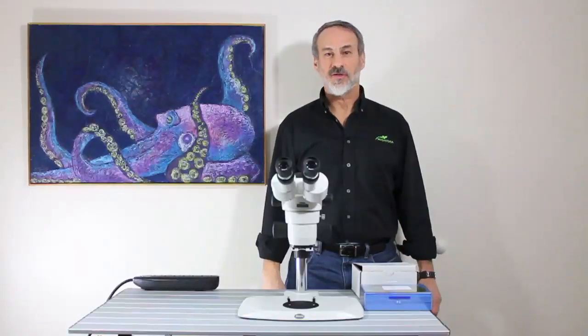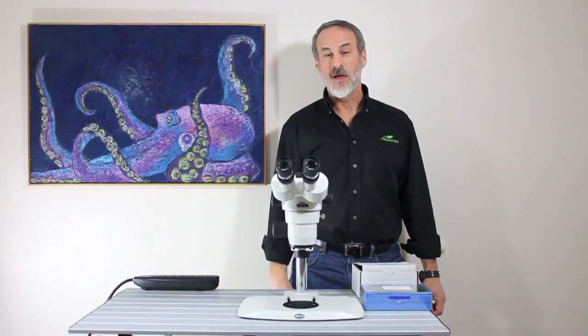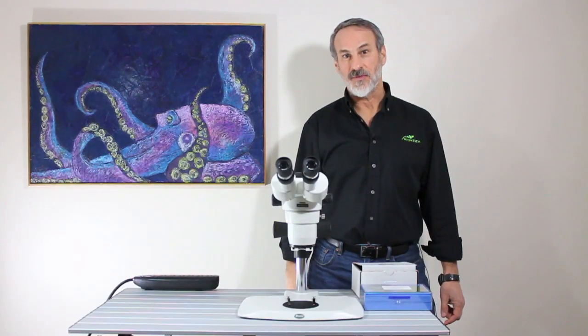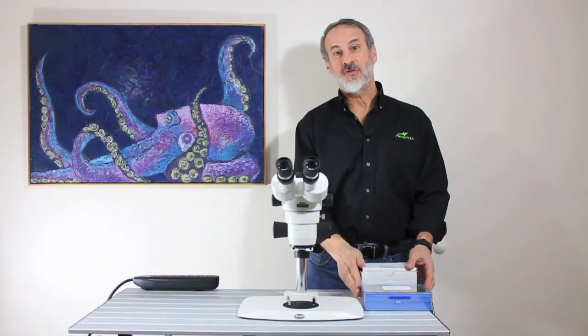I want to show you how quick and easy it is to use the Knight C SFA system to adapt just about any conventional stereo microscope for fluorescence. Everything you need is in these two small boxes.